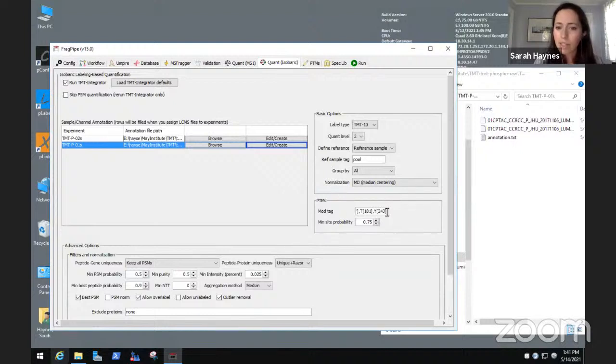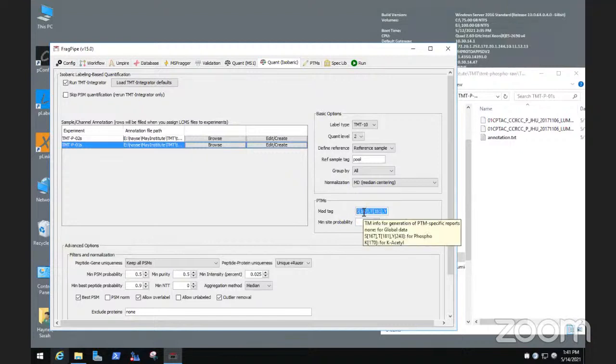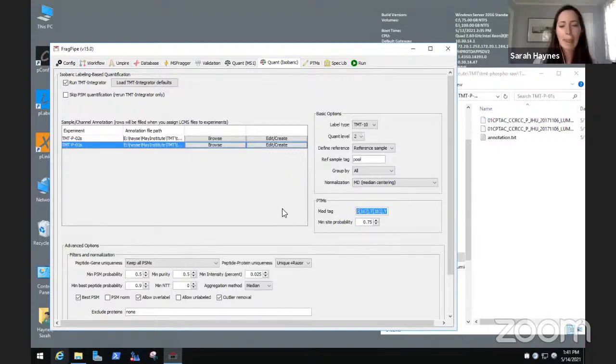Alexey, is there anything else we wanted to note on this tab? I think one thing I'll say is that, oh, go ahead. I don't know if you, go ahead, describe this part first.